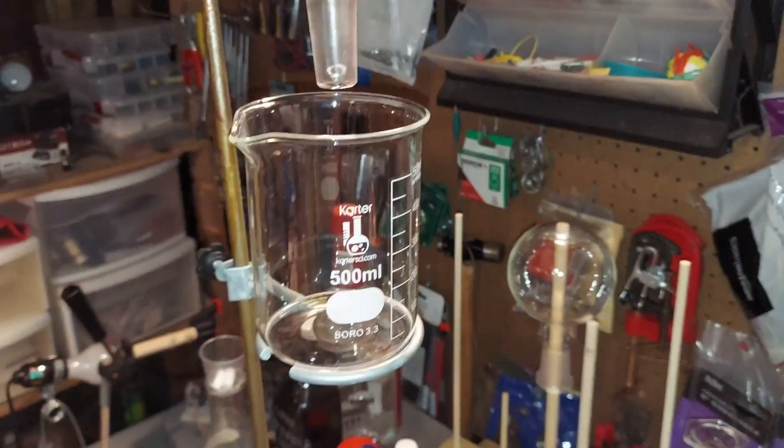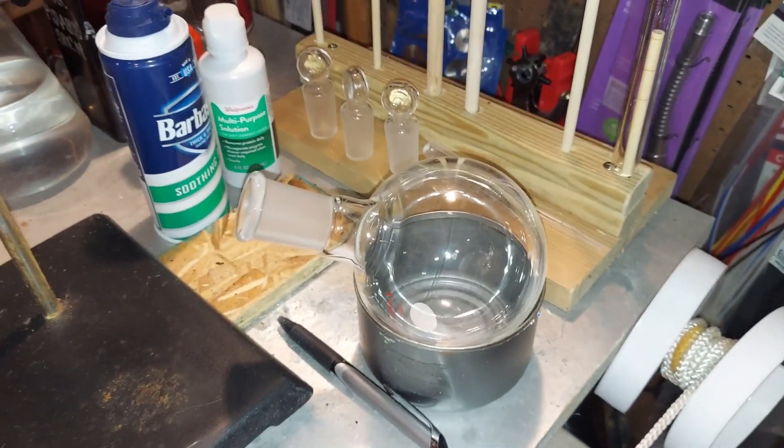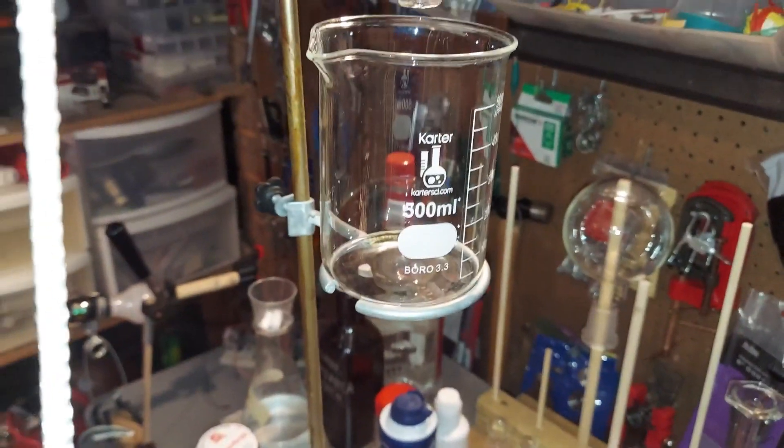Once the thermometer up here goes from 100 degrees to 120 degrees, I know I have nitric acid. I'll remove that beaker and then I know everything coming over is nitric acid, so I'll put on another container there to collect it.